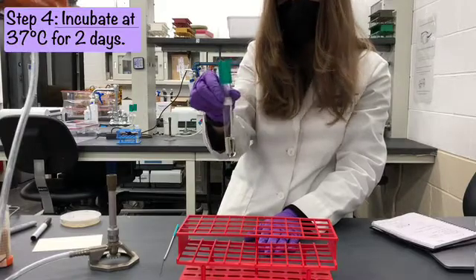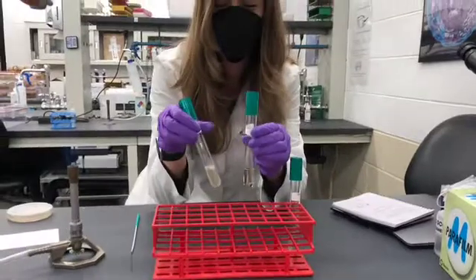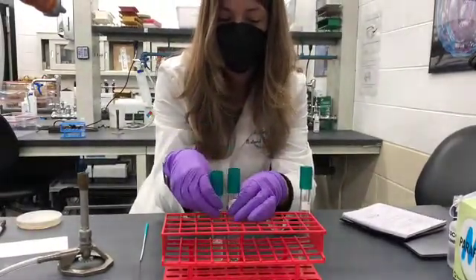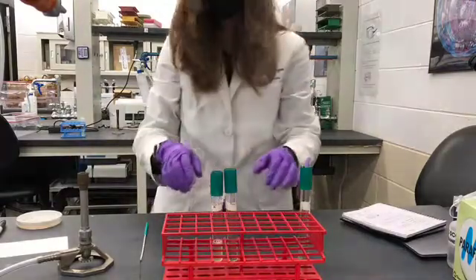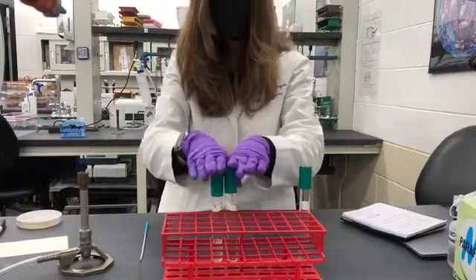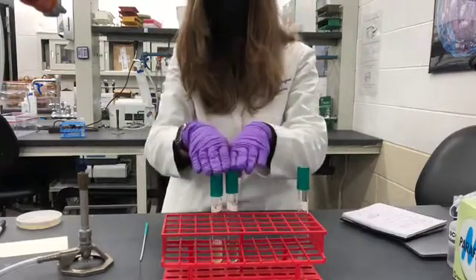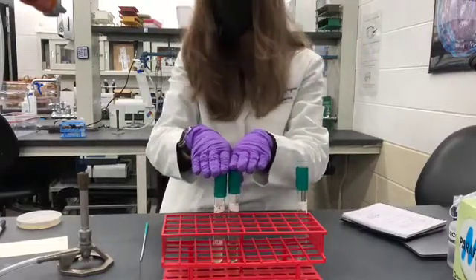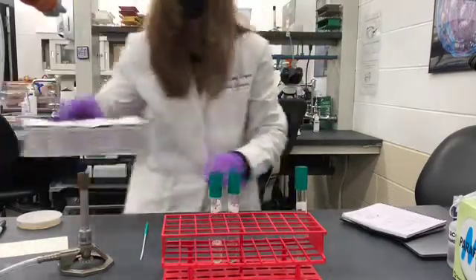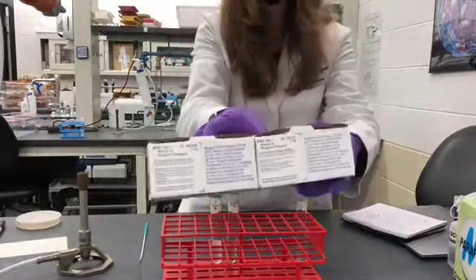Now your tube is ready to be incubated for two days at 37 degrees. That's what all of our cultures are going for. Now we're going to look at two samples that have been growing after two days to determine whether nitrite has accumulated and replaced the initial nitrate, using these two reagents.